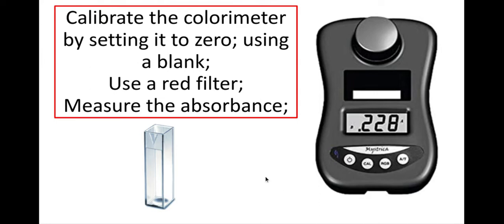So to do that, what I would do is I'd fill one of these cuvettes with water and I'd put it inside there and close the lid. What I'd then do is I'd set it to zero by pressing this calibratory button here and it would set the absorbance to zero.